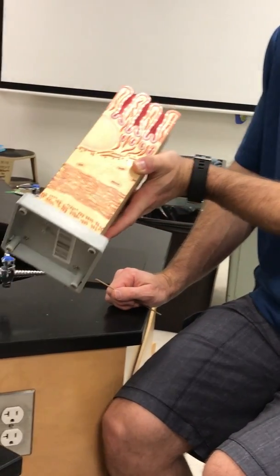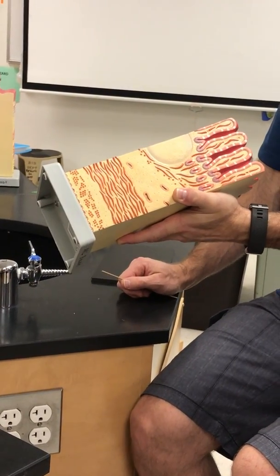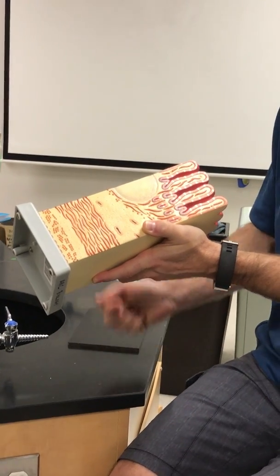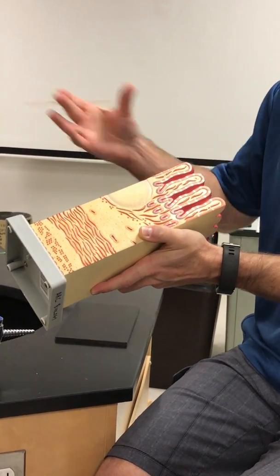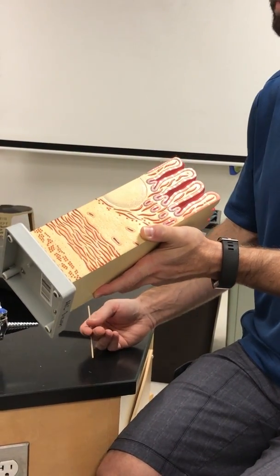Yeah, so I think they decided on the key to make it jejunum. It could be ileum. We'd have to see two side by side to compare. So if one had small follicles and the other had really large ones, then the one with large would be ileum, and that'd be Peyer's patches.